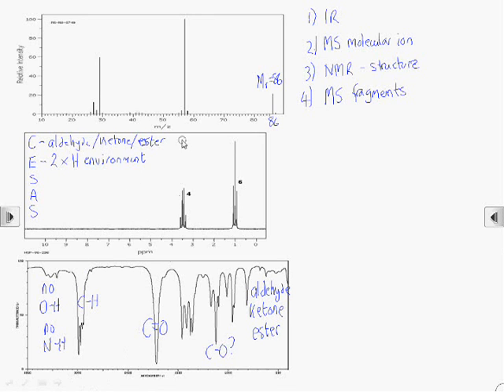Let's label those A and B. If we look now at the chemical shift information, it's also worth noting that there is no absorption between 9 and 10 ppm where we might expect an aldehyde proton to show up. So this is not an aldehyde. We can eliminate that from the list.